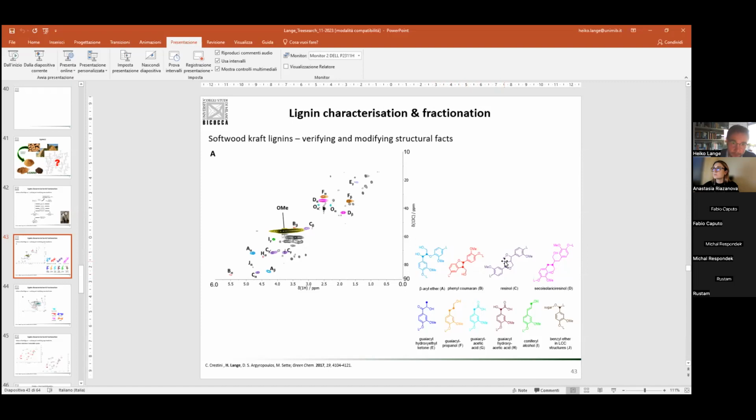There's no NMR technique that will give you that information. This is a type of information that we need to get from a high resolution mass spectrometry analysis. But even with high resolution mass spectrometry, people try it, and there are huge discussions about that.